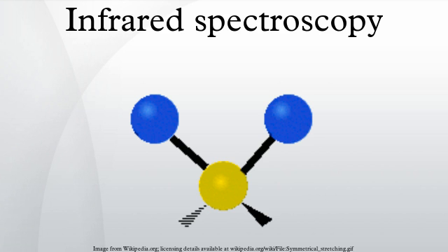The nonlinear two-dimensional infrared spectrum is a two-dimensional correlation plot of the frequency ω1 that was excited by the initial pump pulses and the frequency ω3 excited by the probe pulse after the waiting time. This allows the observation of coupling between different vibrational modes. Because of its extremely fine time resolution, it can be used to monitor molecular dynamics on a picosecond time scale. It is still a largely unexplored technique and is becoming increasingly popular for fundamental research.